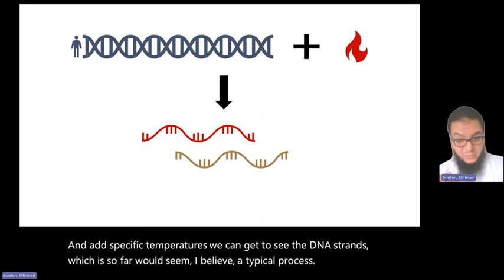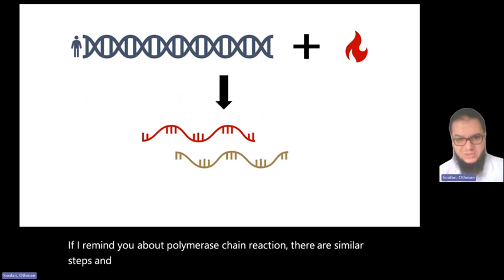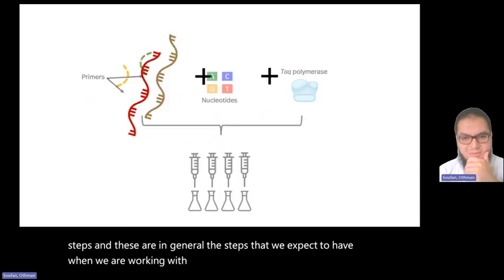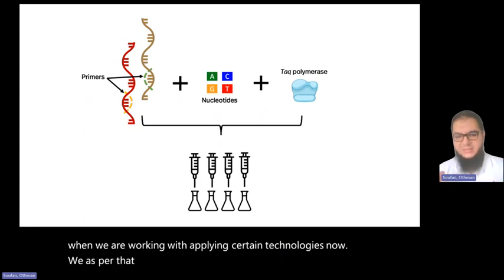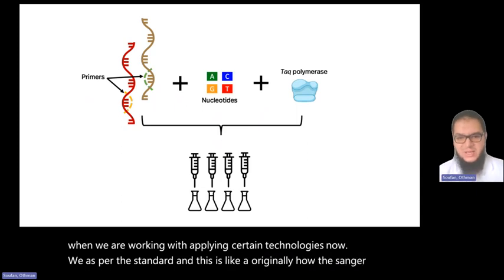If I remind you about polymerase chain reaction, there are similar steps, and these are in general the steps that we expect to have when we are working with applying certain technologies. Now, as per the standard, this is like originally how the Sanger technology worked.